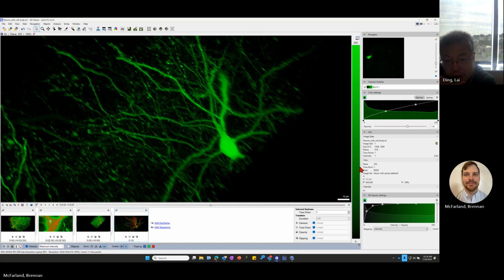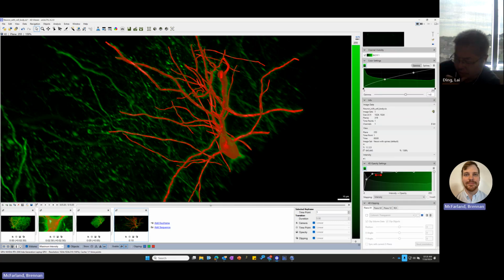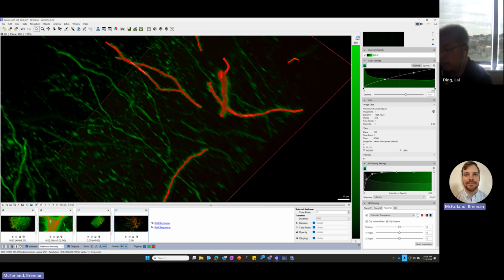and off. So one way we can do that is if we turn these objects on, and if we right click on any of the empty spaces in this panel over here, there's this option called 4D clipping. And we can pick essentially the direction, or rather the plane, that we want to clip on. So maybe if we want to go across the image, we can pick a Y over Z. We'll hit this color transparent. Maybe not this, maybe we'll do XY.